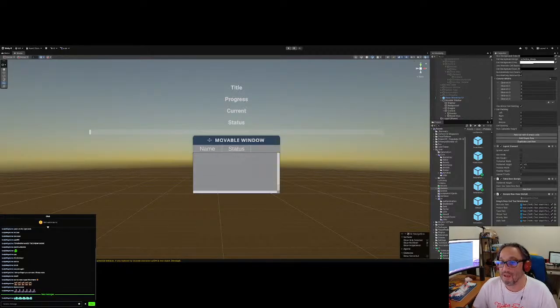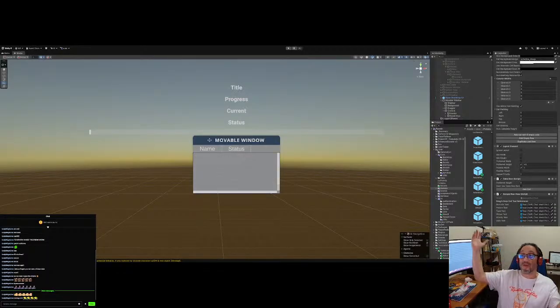The reason why I chose Enhanced Scroller is because we have a set of users and we don't know what's going to happen. They may only have a small set of samples, or they could be a big company referencing millions of samples at the same time, or thousands of samples. So you need to do that. And with Enhanced Scroller you are recycling the UI, so you're never going to run out of memory, because you're just recycling and querying the data.